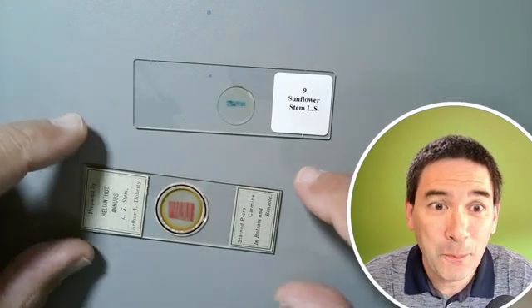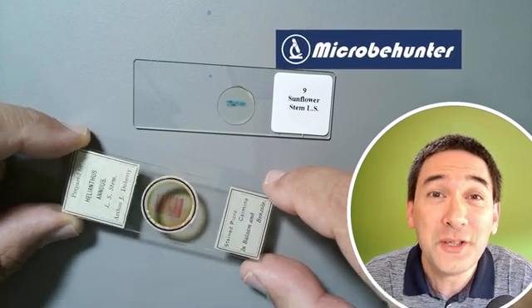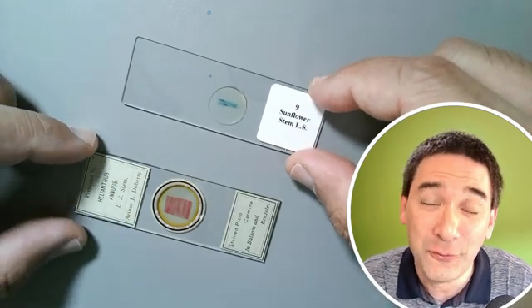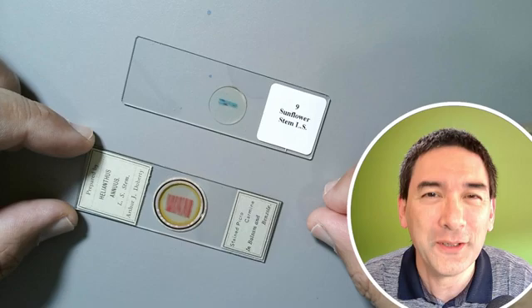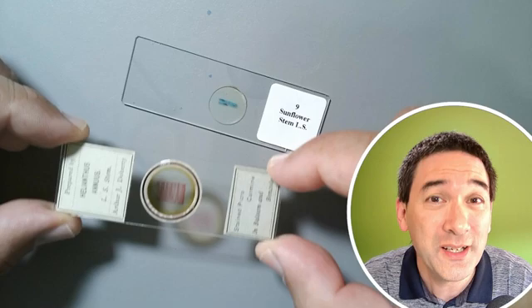Today I would like to compare this beautiful antique microscope slide, which is over 120 years old, with this modern slide here. Both of them show the same specimen — a sunflower — however it looks a little bit different under the microscope, and we're going to compare those two and I'm going to show you why this antique microscope slide is actually so much better.